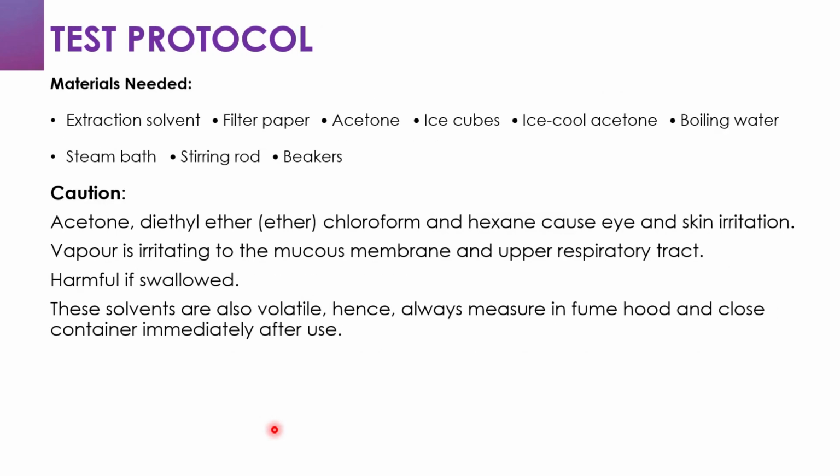So now let's look at the test protocol. We'll start by looking at the materials needed. We have our extraction solvent, the filter paper, acetone, ice cold acetone, boiling water, steam bath, stirring rod, and beakers.